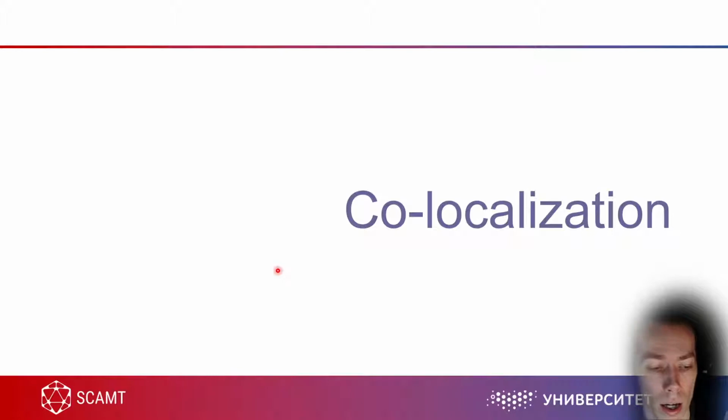Co-localization. Probably after these couple of slides, we will have a test. Be prepared. So co-localization, what does this mean? It means that in some cases you need to understand where your nanoparticles accumulate in the cell, and this can be important because it will probably provide you information about damage, some of the very first information about damage.